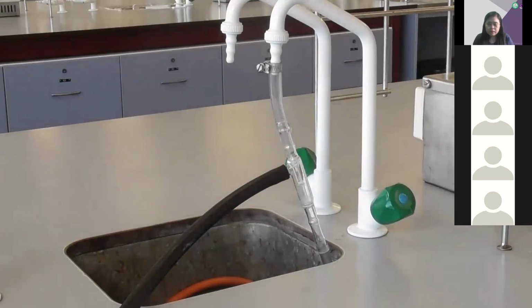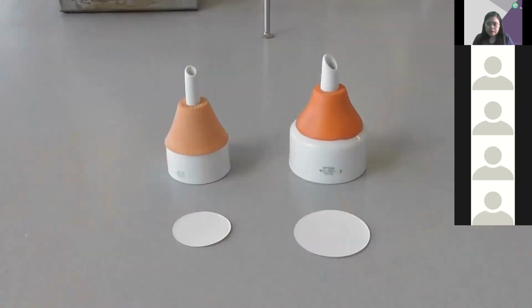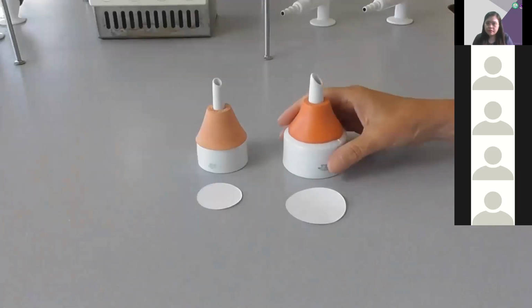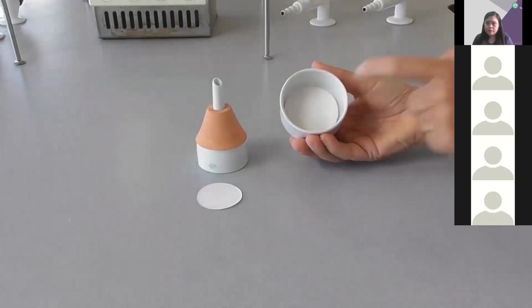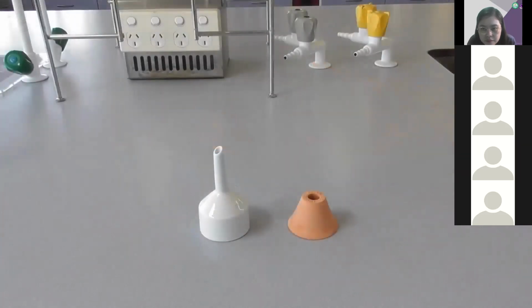To carry out the vacuum filtration, you will also need a Büchner funnel and filter paper. As the Büchner funnels come in different sizes, you must check that you are using the right size of filter paper for your funnel. The filter paper should fit snugly on the bottom of the funnel, covering all of the holes.